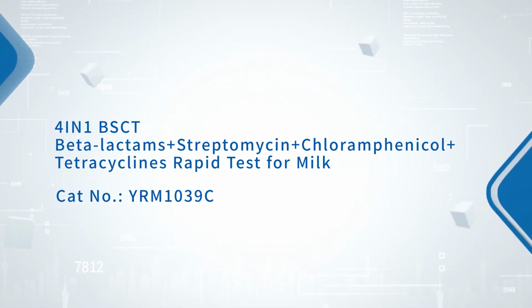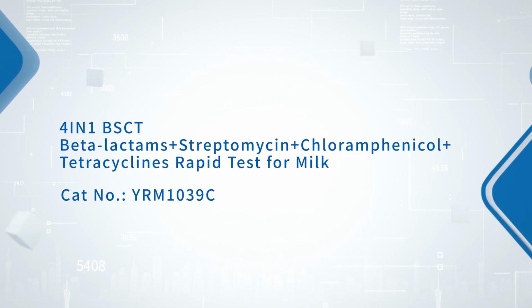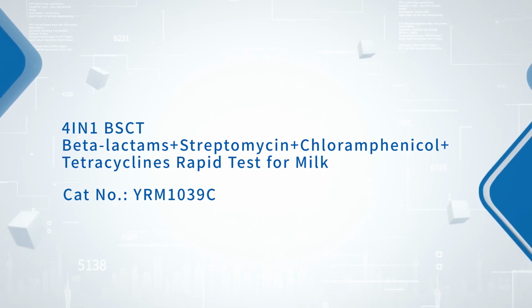4 in 1 BSCT: beta-lactams plus streptomycin plus chloramphenicol plus tetracyclines rapid test for milk.